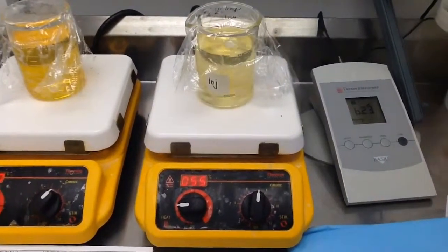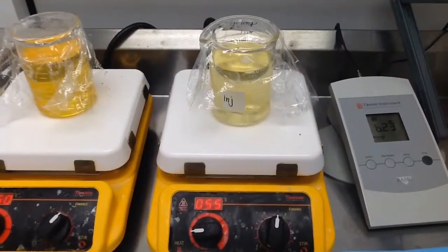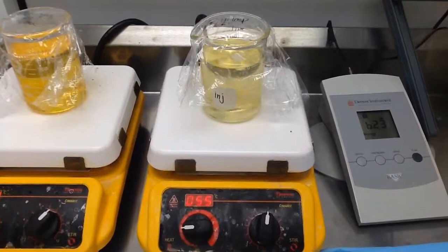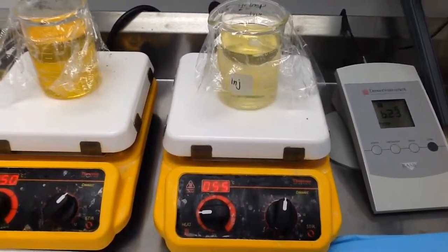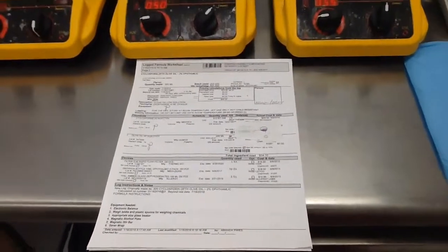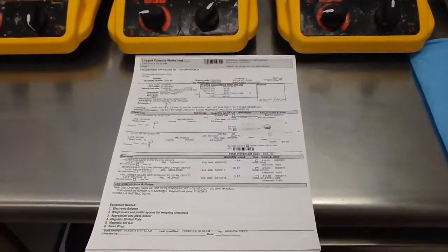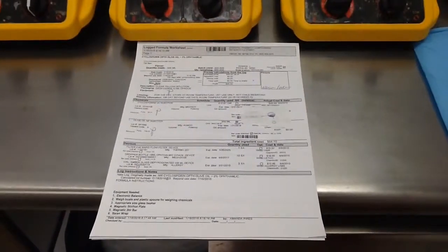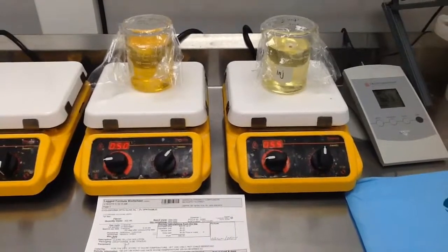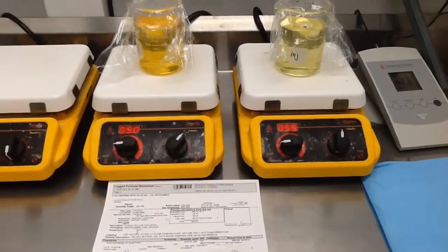And so this will mix on very low heat until it's completely dissolved. Once it's dissolved, we're going to take it into the buffer room and pre-filter it with a 0.45 filter just to get out the bigger particles. And then after that, we cook it in the oven until it's sterilized. I'm going to be showing you the entire process step by step. And this would be the first step, making the formula, mixing the drug in. And next I will show you how we pre-filter.